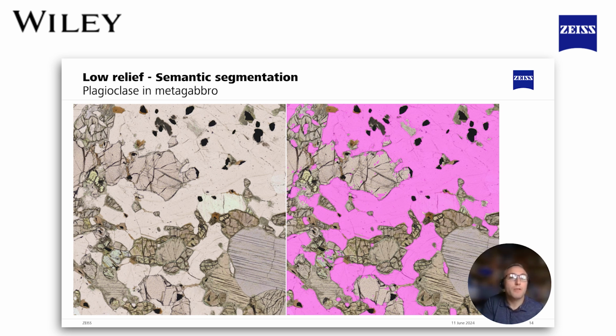So once again, moving to a very different type of rock sample. This is now a high-grade metamorphic rock, a long way away from the microfossils that we were just looking at. But it's another really typical problem for light microscopy in geosciences that makes it really hard to automate segmentation routines, particularly for tasks that, once we're trained, we find quite easy to look at.